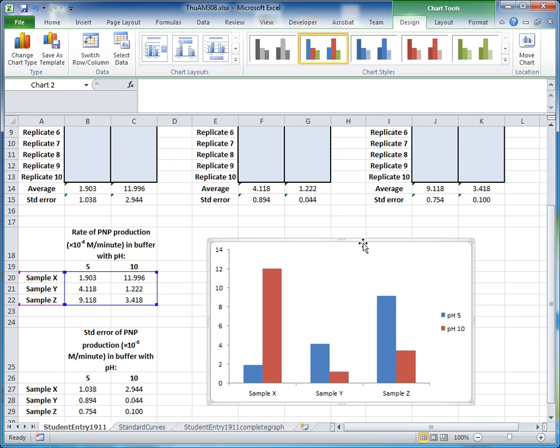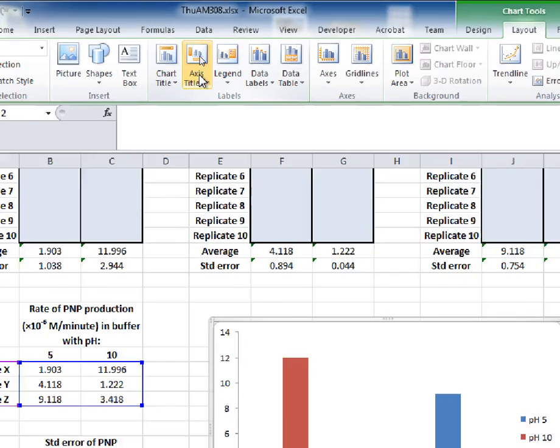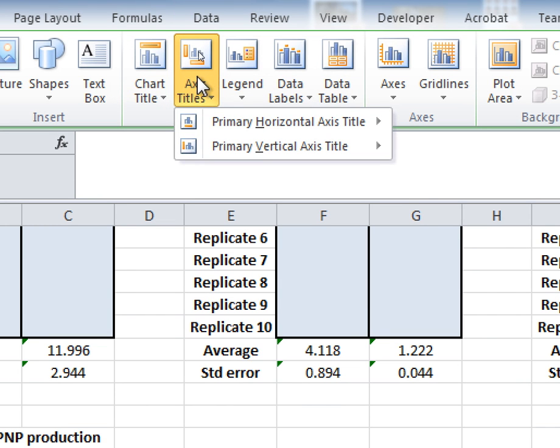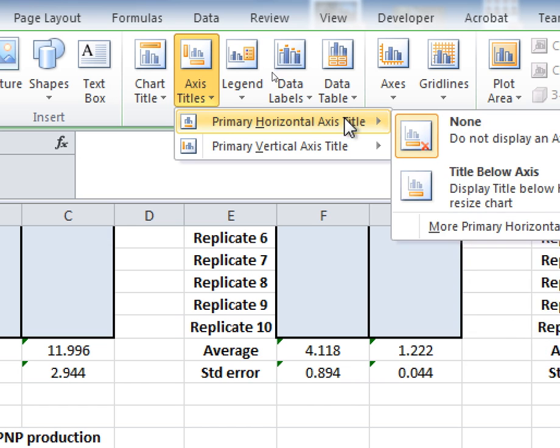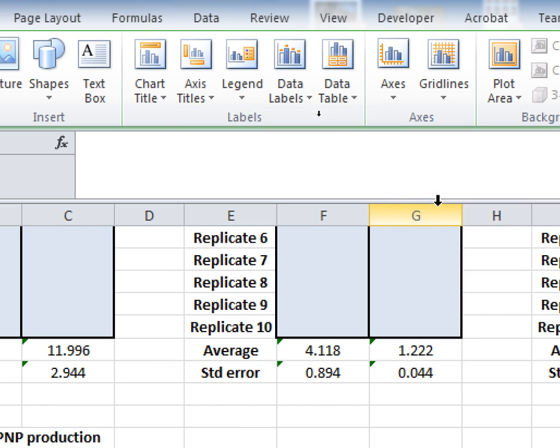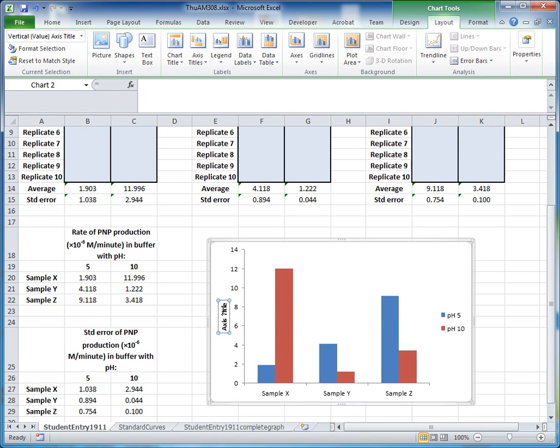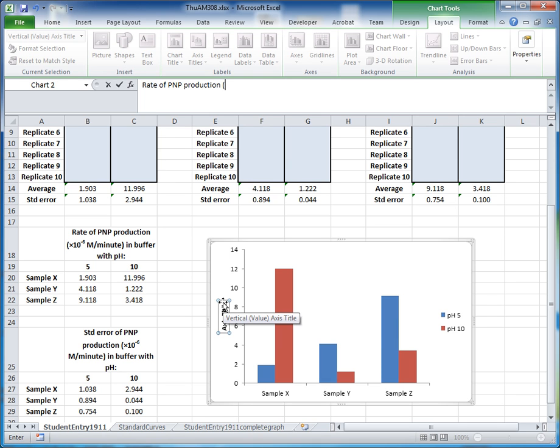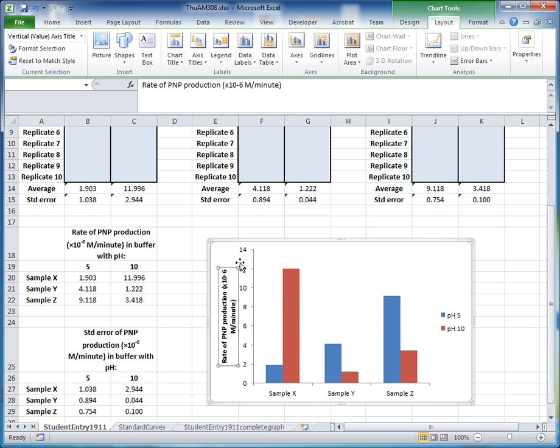Next, add a y-axis title so the values of 0 to 14 are meaningful. Go to the Chart Tools Layout tab and click the Axis Title button. Select the vertical axis title option. When the axis title appears, type in the title: 'Rate of PNP production', and add units — times 10 to the minus six molar per minute. It's always good to include units.